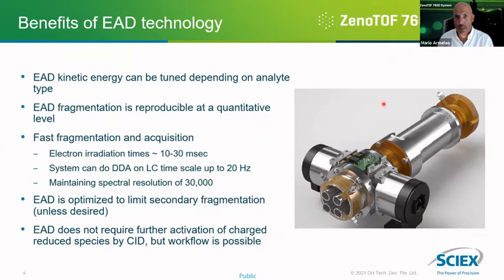So it's a very high capacity trap, so much more capacity than the detector, and it does not scan. It merely lets the ions exit the collision cell in a way that they reach the pusher and the TOF perfectly aligned, increasing duty cycle in a QTOF-based system to almost 100%, so over 90%.